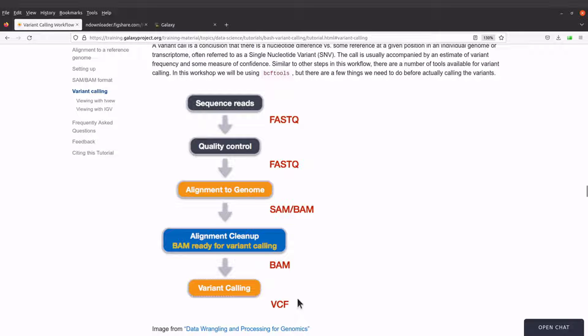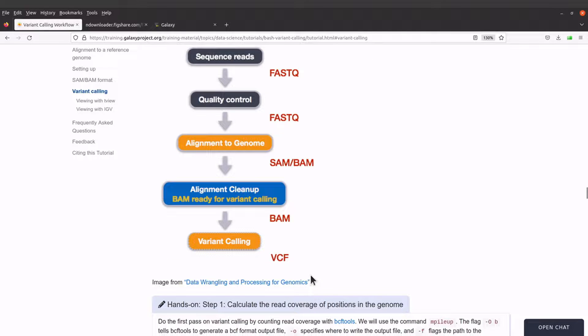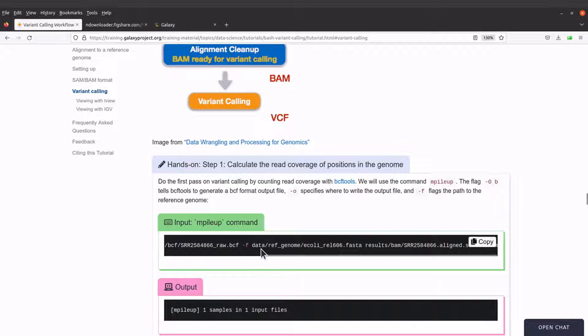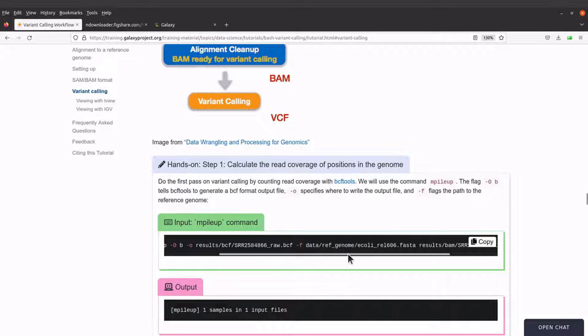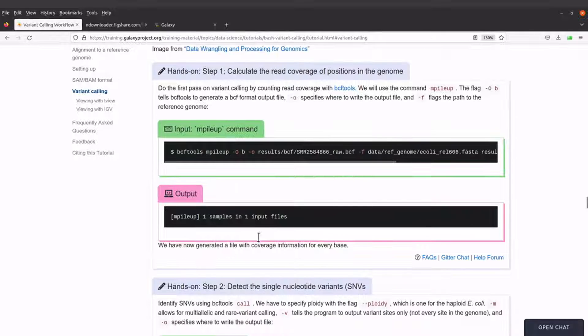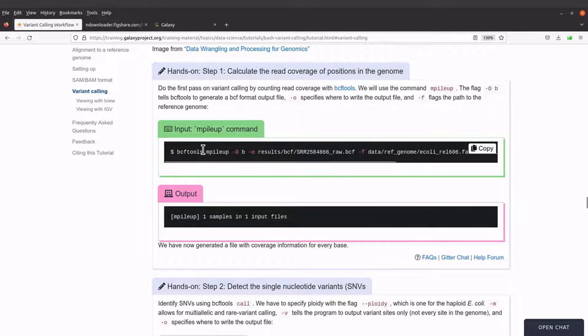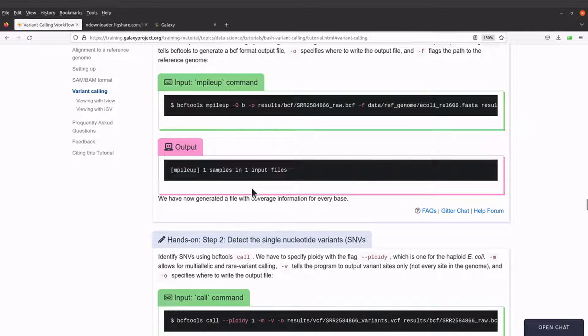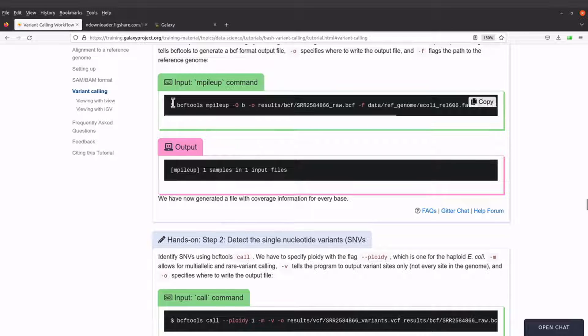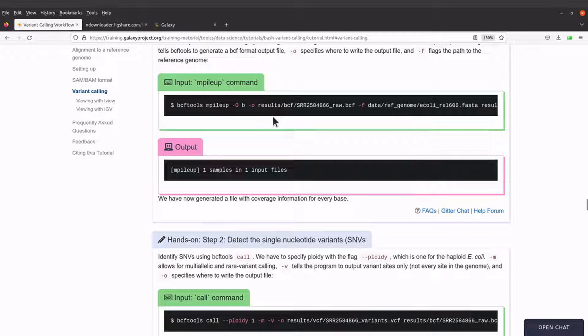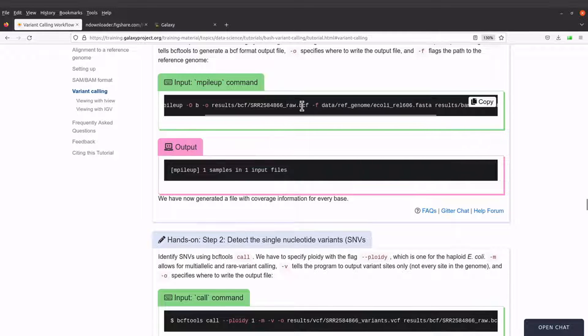So we will perform the variant calling. We will use bcftools. So for bcftools we will call bcftools mpileup first and then we are going to call the bcftools call command also. So you have this first and then you have this. That's what we are going to do. So let's proceed.